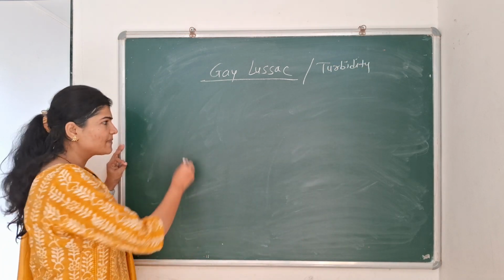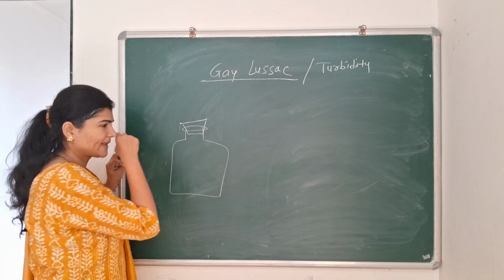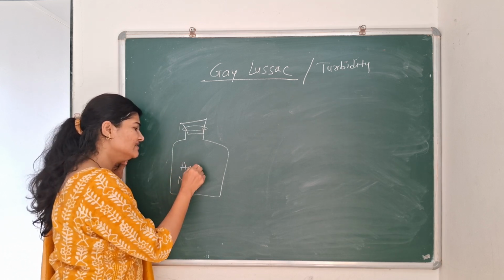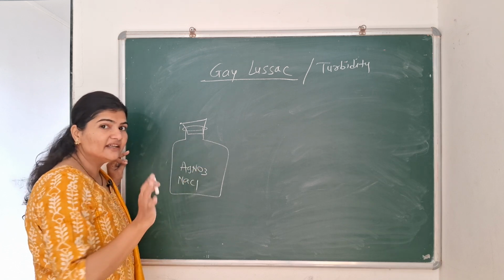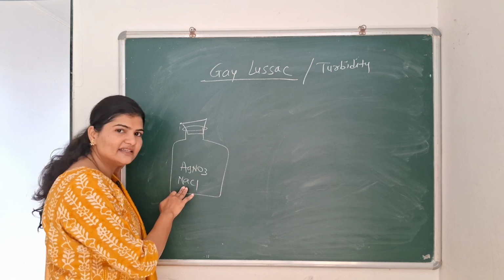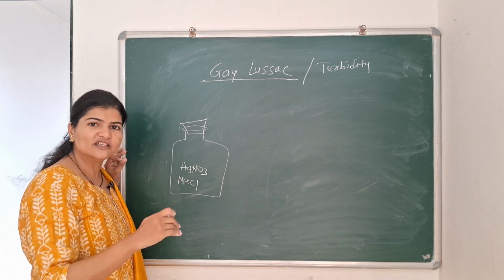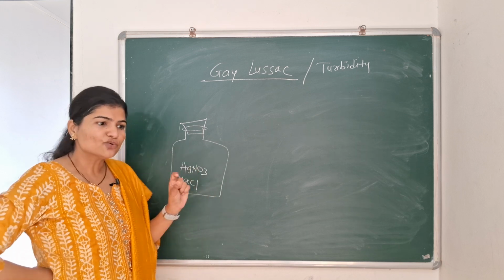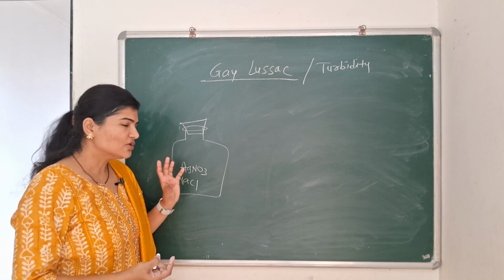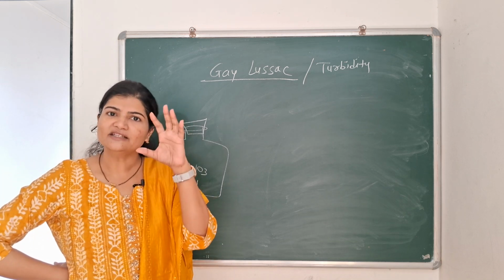So what we will do in this, instead of a conical flask, we can use a reagent bottle which is stoppered. We will add sodium chloride, which is our analyte, and we will add silver nitrate, which is our titrant. So silver nitrate isn't added in excess. Say if we know that for 100 ml NaCl we are going to require 100 ml AgNO3, we will first add 50-60 ml AgNO3 and then shake it. Also we will add some coagulant like potassium nitrate or barium nitrate. Once the precipitation is complete, the coagulant will settle the precipitate down.